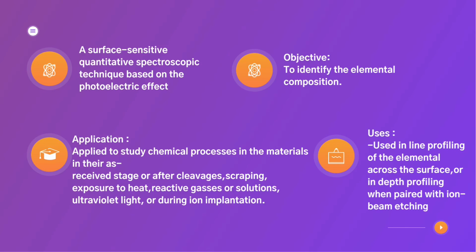It is applied to study chemical processes in the materials in their as received stage or after cleavage, scraping, exposure to heat, reactive gases or solutions, ultraviolet light, or during ion implantation. It is used in line profiling of the elemental across the surface or in depth profiling when paired with ion beam etching.